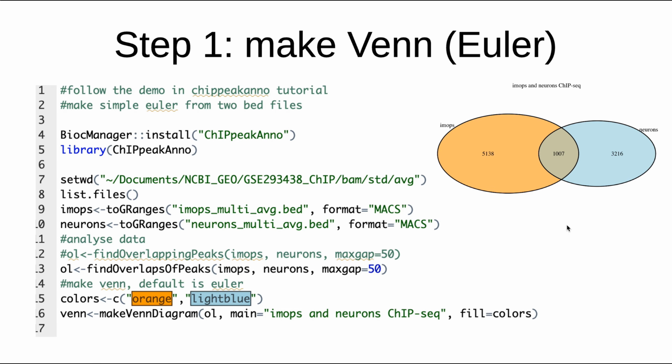To summarize, if you want to compare two bed files and find peaks which are common or unique for any of those bed files, then you use ChIPpeakAnno and write an R script where, by calling makeVennDiagram, you get the Euler diagram and the lists belonging to any of those groups.